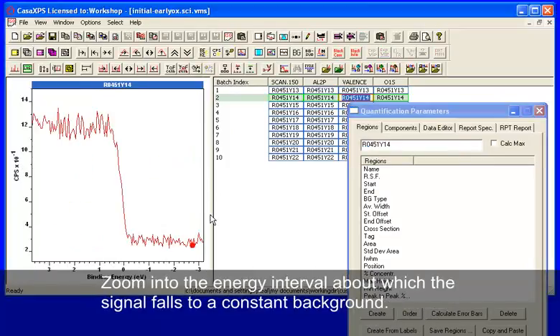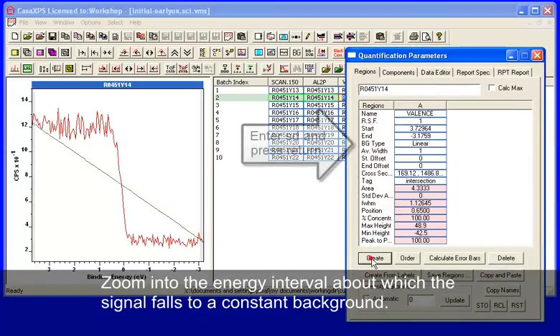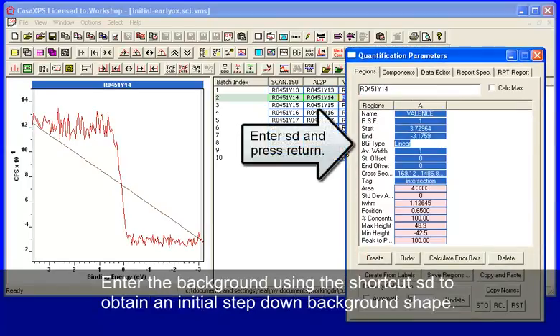One line is calculated from the error function where the point of inflection gives us a position for the line and also the gradient of the line.